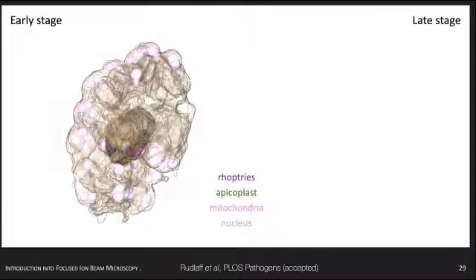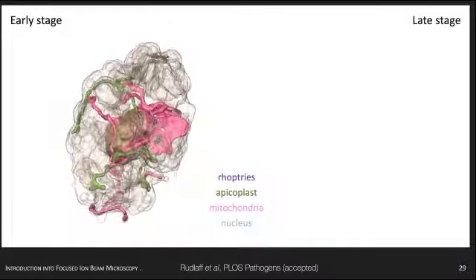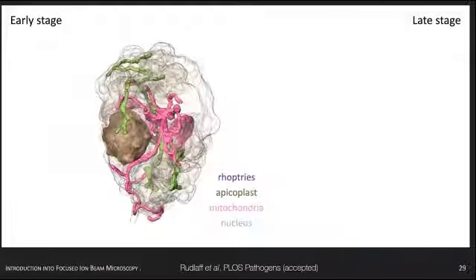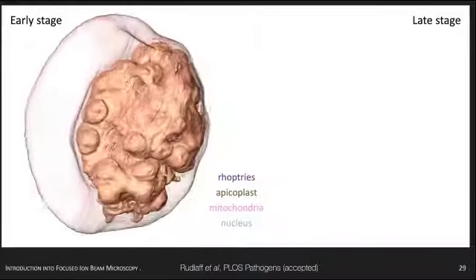And where it gets really interesting is now that you can see here, and let me stop this for a moment. You remember in the TEM images, you saw these cylindrical objects. So it turns out that these cylindrical objects are actually a long network of these organelles that extend throughout the entire object. And without this type of three-dimensional imaging, we would not be able to recognize this kind of feature.